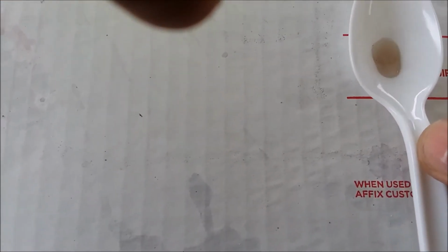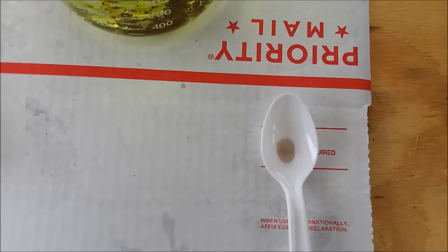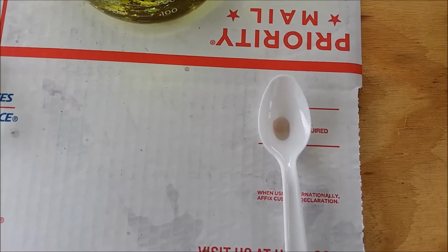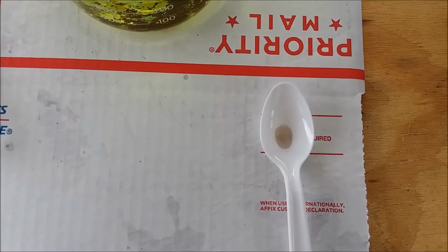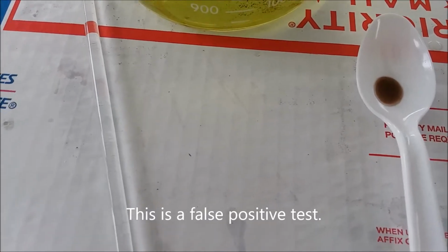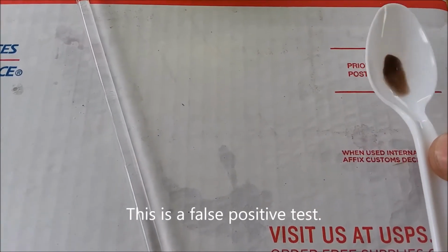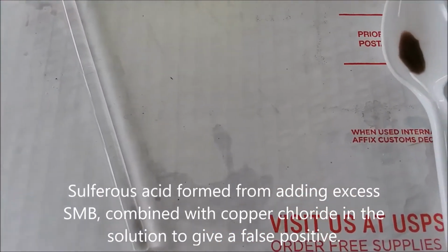Maybe there is still a little bit of gold in solution. It's got a bit of a purplish tinge to it now. Maybe there is a bit of gold in solution. Maybe I'll put a little more sodium metabisulfite in it and let it settle some more. Then test it again. That's interesting. I do believe I'm getting some sort of false positive here. I'll put a little more on.